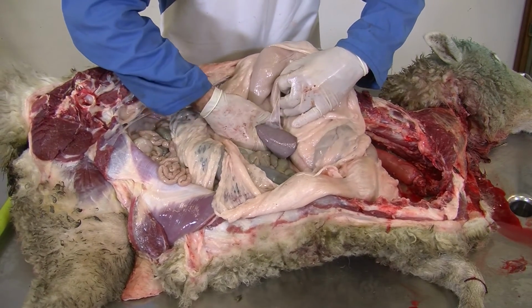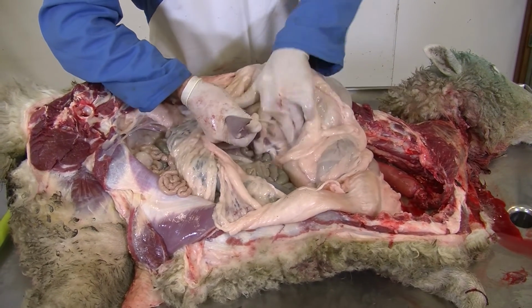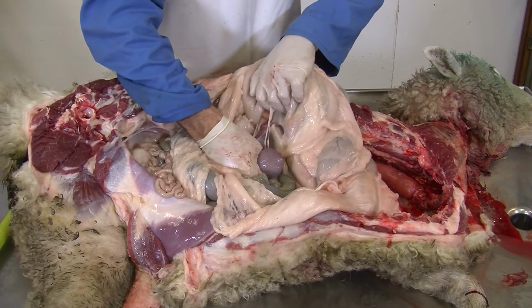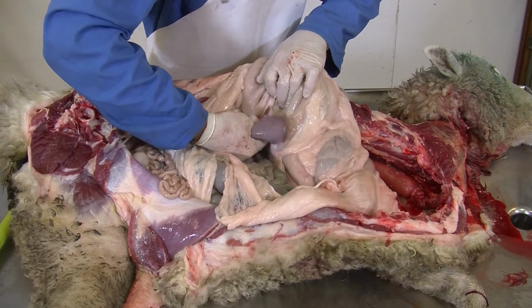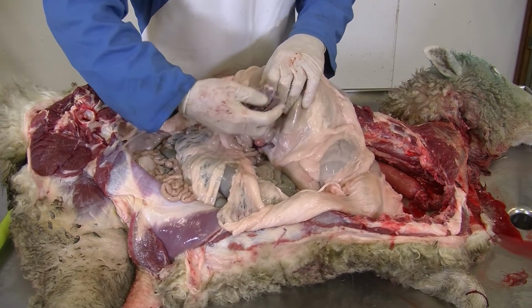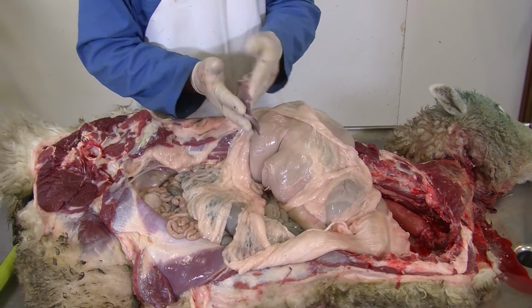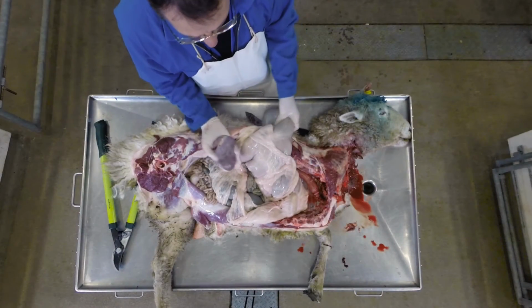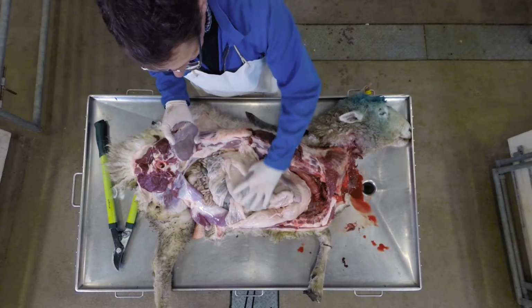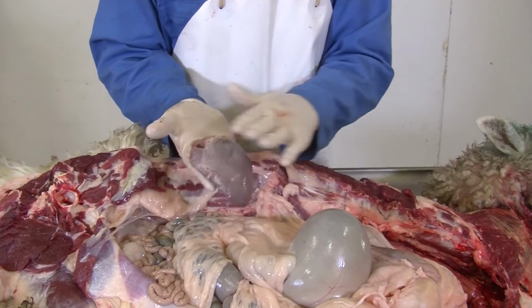So this dark coloured structure I'm just pulling out here is attached to the side of the rumen. It's just down on the other side of the animal from where we've been working. So I've just moved all the rumen out of the way to get to this, and this is the spleen.